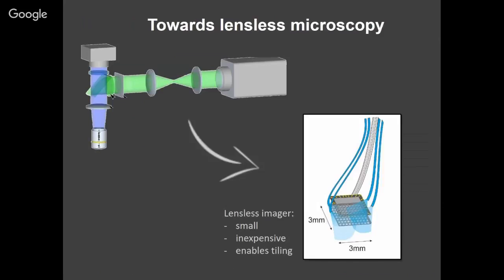But what my lab is working on is trying to push this thing to the lensless version, which is why I started talking about the DiffuserCam, is that there is no need for this microscope whatsoever because we don't care too much about resolution. The size of the neurons is actually pretty big, and so there's really no need for this big fancy microscope here. And so our intention is to replace all of this hardware with a lensless sensor that's just pushed up against the mouse's brain. And we can make a whole bunch of these because they're dirt cheap, and just tile them sideways to get at more volumes. So we're really excited about doing that, but we haven't done it yet. We have this big DARPA project working on that.